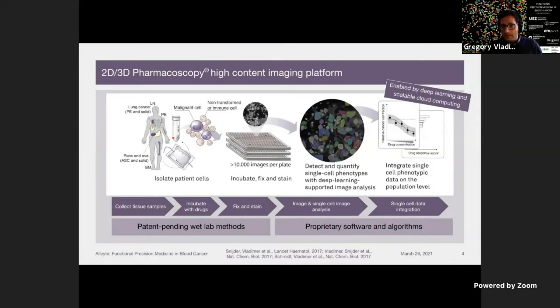organoid creation. And then we take all of our cells and we add them into 384-well, or now 1536-well screening plates, and for some indications we're moving into 1536-well plates. And each of these wells contains a drug of interest, a small molecule, a biologic, or a cell therapy.